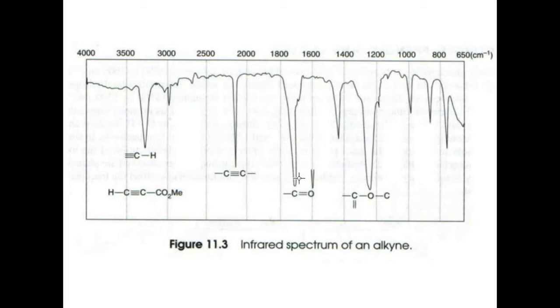Now one of the bigger peaks is this peak here. It is located at about 1720 and it's caused by the absorption of the carbonyl group undergoing a stretching motion. The C double bond O stretching. We've mentioned that that C double bond O stretch produces fairly large prominent peaks. What that means then is that during the course of a carbonyl stretching motion, there's a significant change in polarity producing a larger peak, resulting in more photons being absorbed. Now these peaks on the right are bending peaks.